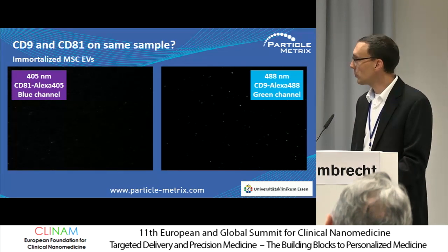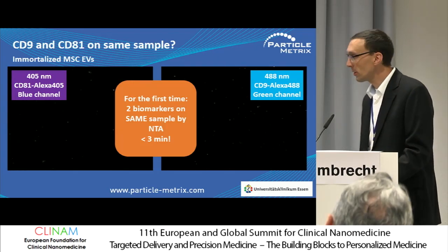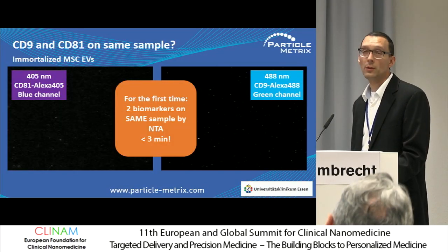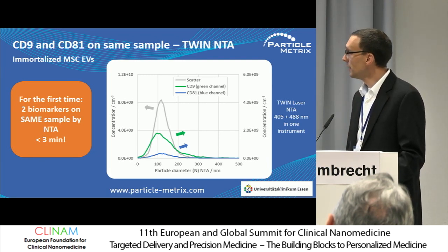So basically by switching, we can measure the 2 biomarkers on the same sample, and this is actually data we present for the first time, basically in sequence 2 biomarkers within 3 minutes, which is quite fast. So the data is in good correlation.